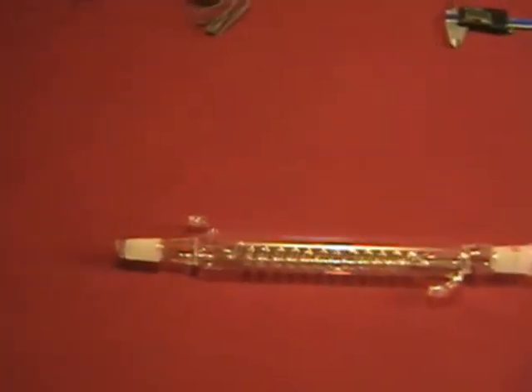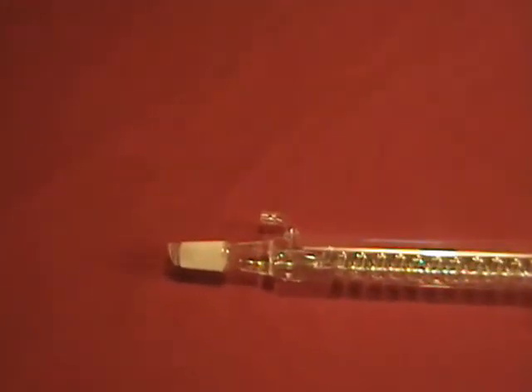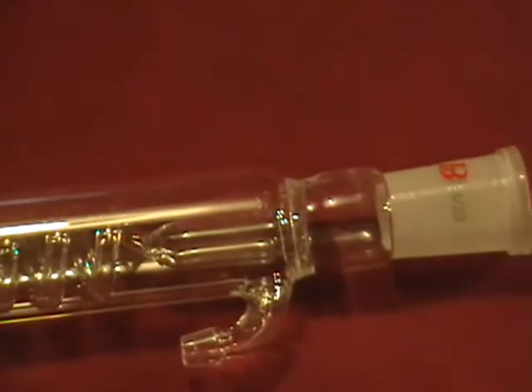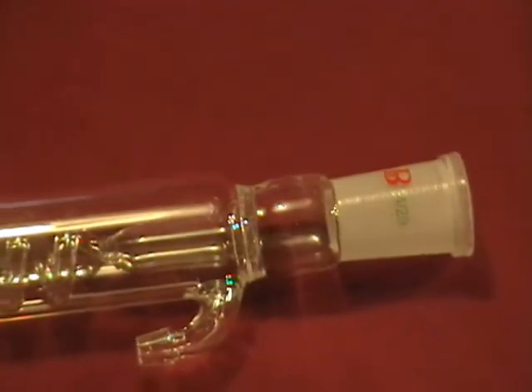This is a new Gram condenser with an effective jacket length of 250 millimeters. It has both male and female 24/40 ground glass joints. Shipping insurance is included on every order, even internationally.